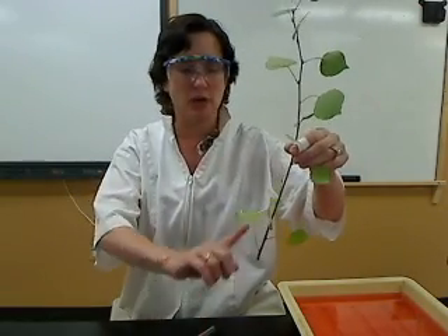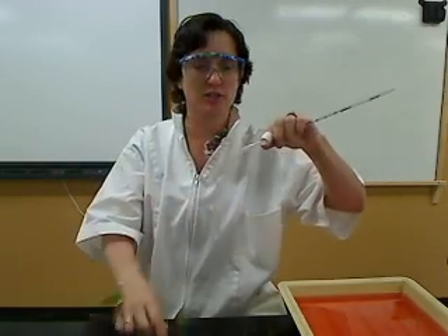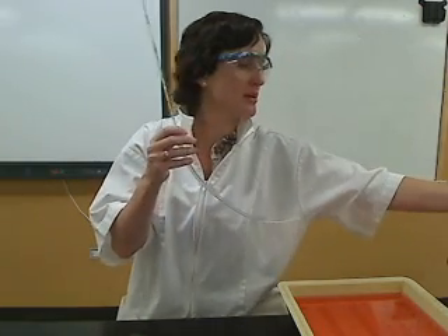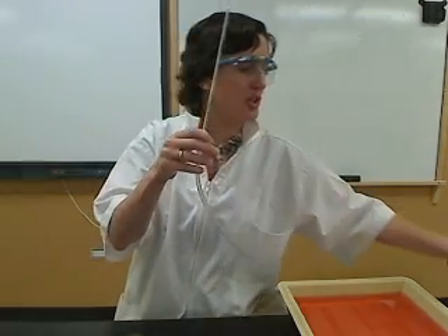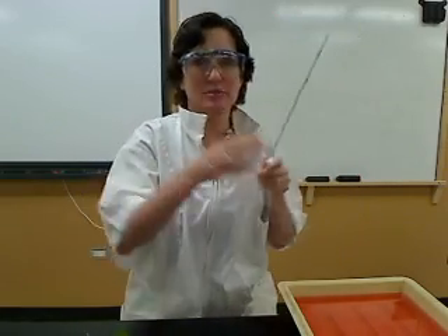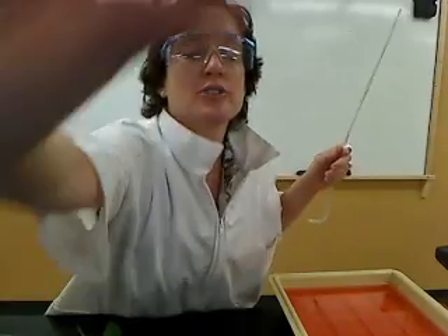How do we set this up? We want to see the flow of water going up into the stem and then out through the leaves. The way to do that is to use some glass tubing and some plastic tubing. There's a bin of glass tubes and a bin of plastic tubing, so pick whichever tubing is appropriate for the plant you selected. I'm going to turn the camera down to this tray of water — you might notice the water is red.